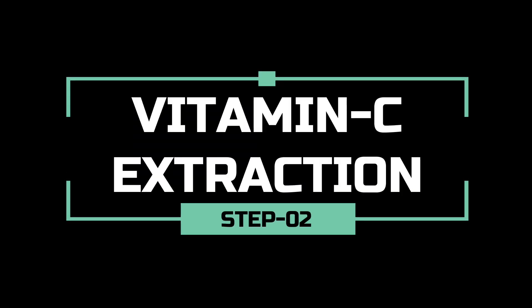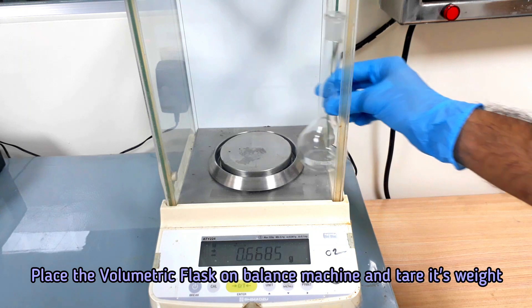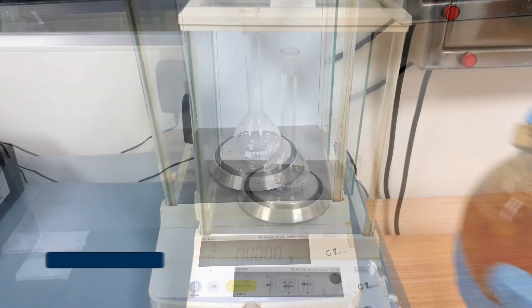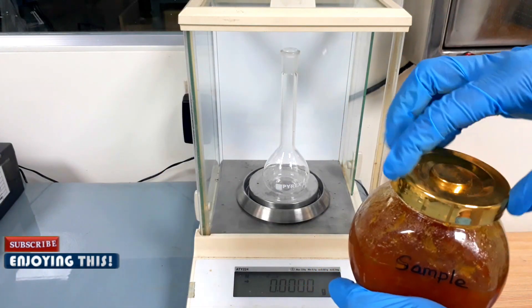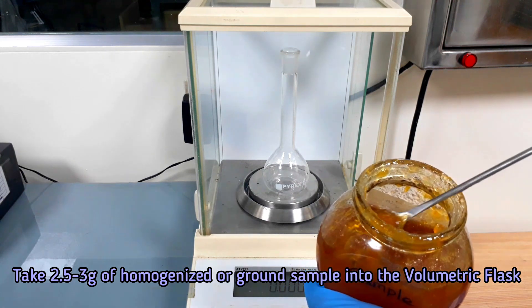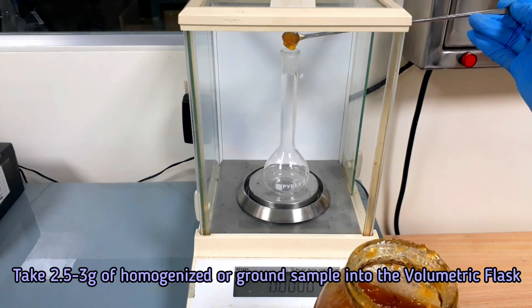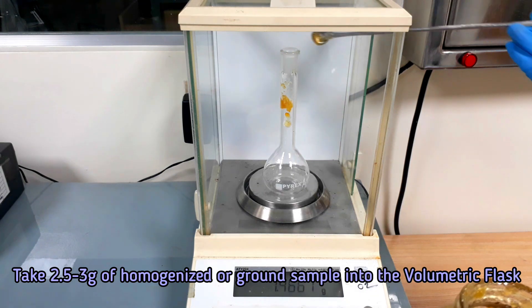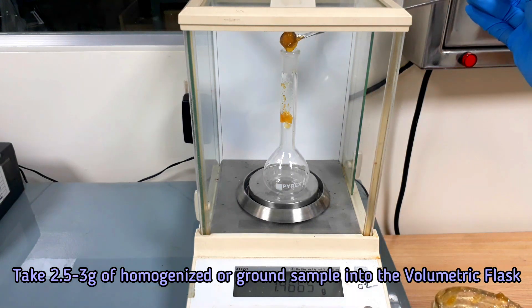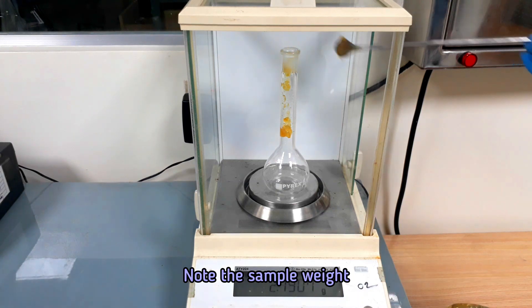Now we are ready for the vitamin C extraction from our sample. Take 2.5 to 3g of homogenized or finely ground sample into a volumetric flask. Note the sample weight.